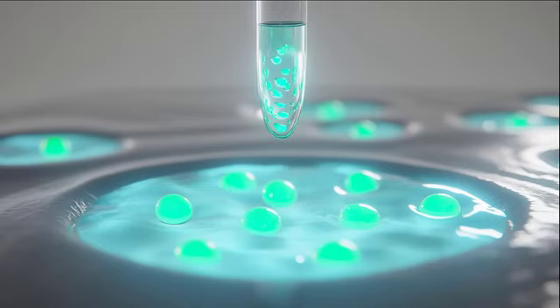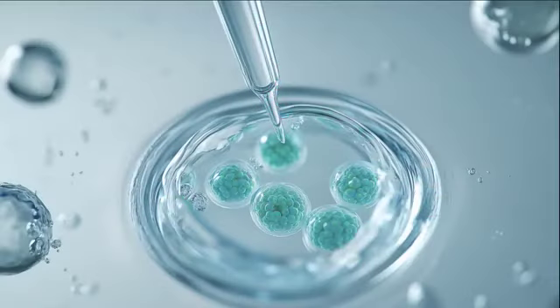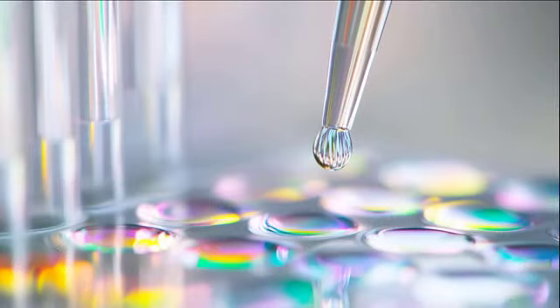Magnetic manipulation within Lab-on-a-Chip systems allows for selective control of magnetically responsive particles. For example, magnetic beads coated with antibodies can be guided to capture specific proteins, much like using a magnet to pull metal filings from a mixture, enabling targeted separation and analysis.